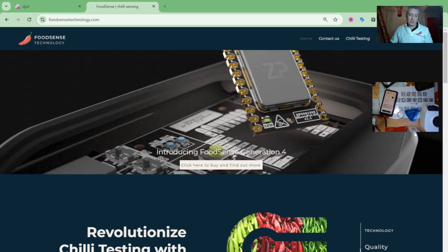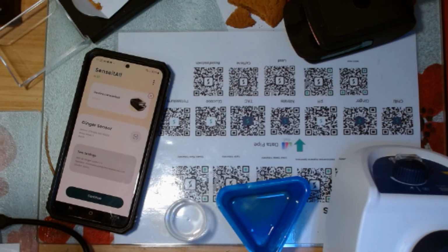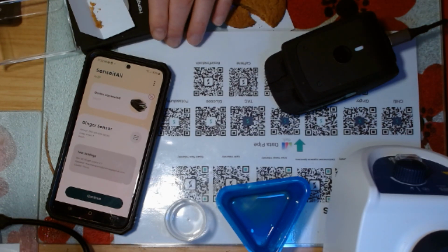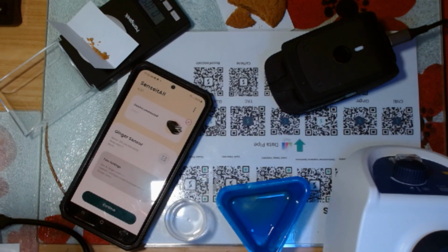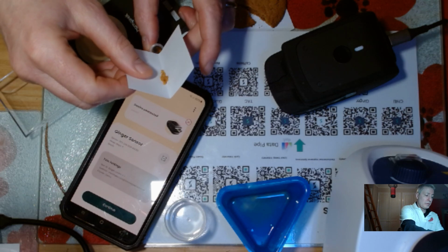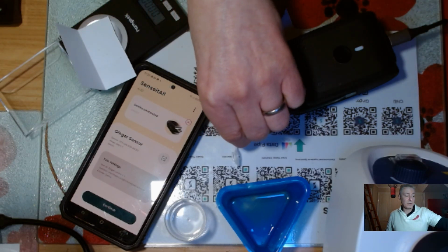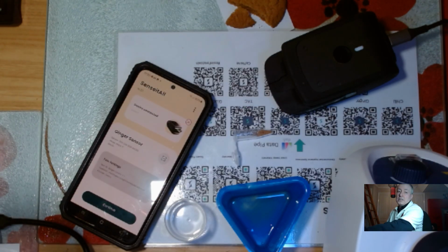But that said, I've got the technology in front of us, and I will start clicking and getting this going. The first thing I'm going to do is say I've got 100 milligrams already pre-weighed out on this balance. I'll get a little tube and transfer the ginger biscuit. I took a mortar and pestle and got the ginger biscuit into that little vial. All very fun. I'll take that scale out of the way now so that I can see.